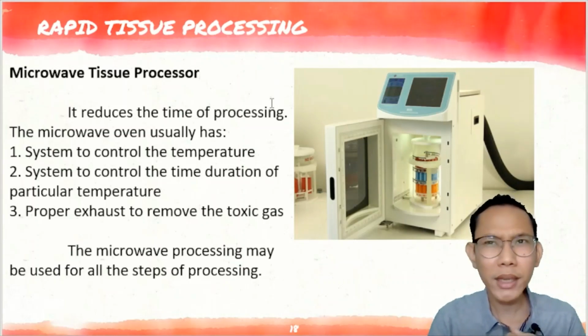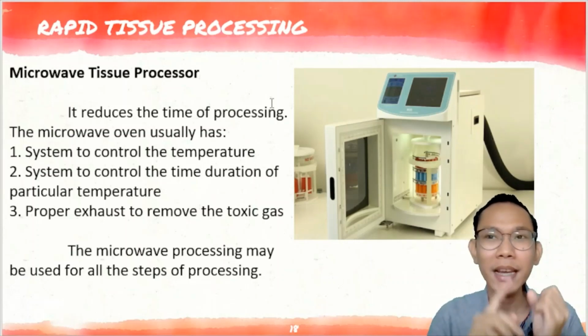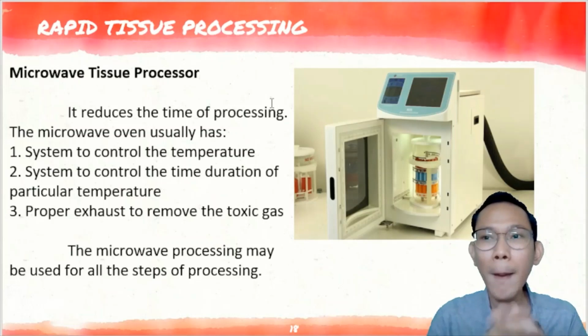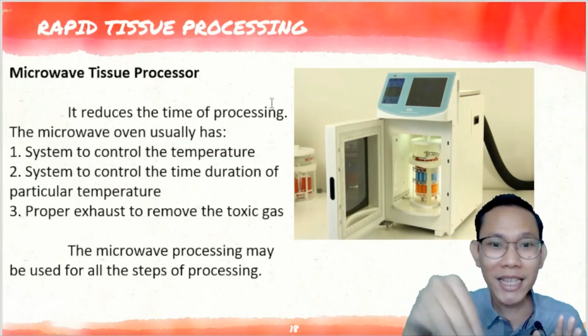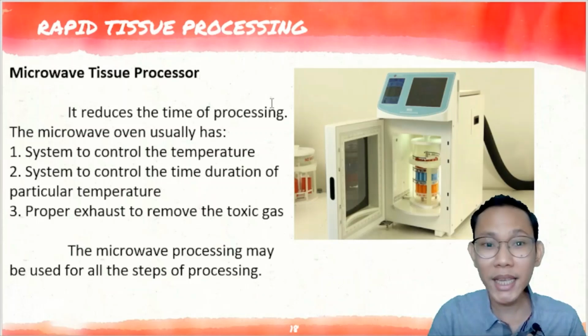Kasi nga, Doc, automated nga siya, Doc, diba? So in short, mas mabilis. Of course, binibilisan niya yung steps. Kasi nga, diba, remember, sa conventional or manual step, anong ginagamit natin? Pag manual lamang, yung tinatransfer natin manually. Pag automated, same pa rin. Tinatransfer, pero ang tinatransfer yung machine. Pero the number of steps is the same.